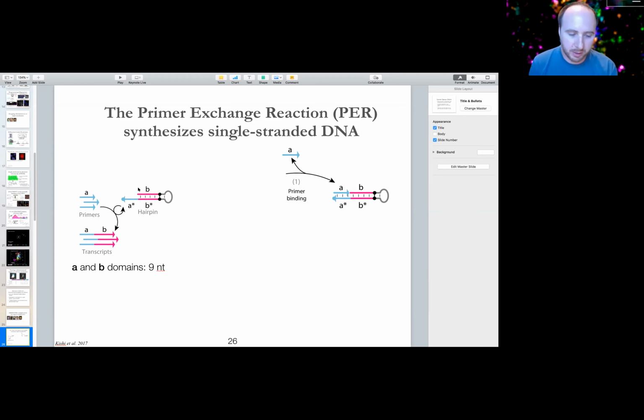And I'm just going to explain quickly the schema we use to describe some of these sequence domains in this kind of format. So if we have a sequence A, then A star would refer to the reverse complement of that sequence, such that they would base pair together if they were to meet under favorable conditions. So following along that, we have a B star stem loop here in our hairpin where these sequences are base pairing together. And the goal of PER is to have this special hairpin, and I'll explain a little bit more how it works in a sec, be able to sense that it's seeing this A molecule and affect a change, which in this case is to append the B sequence onto A.